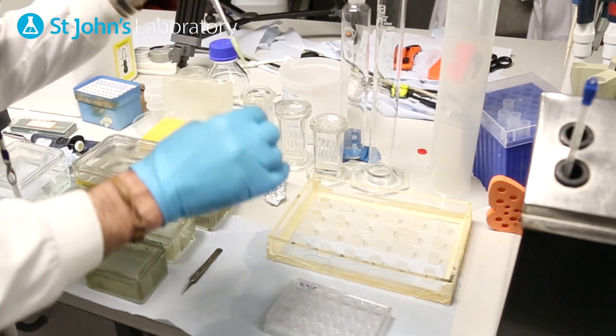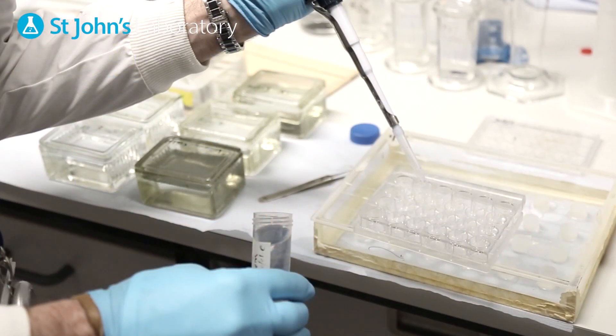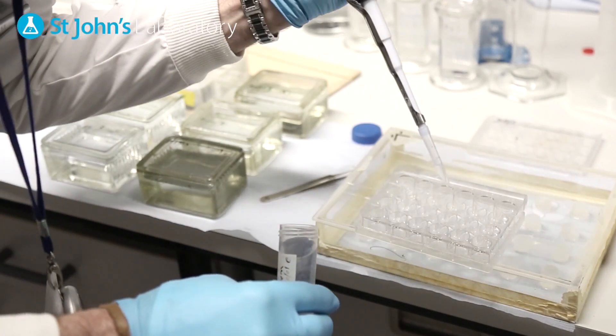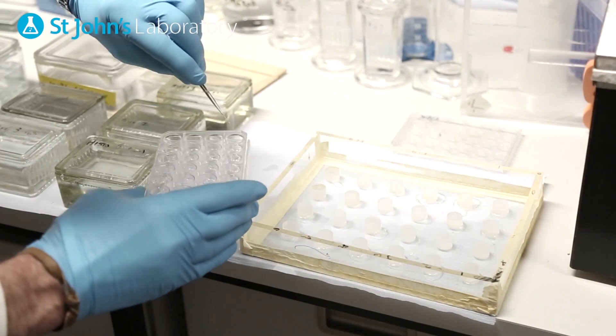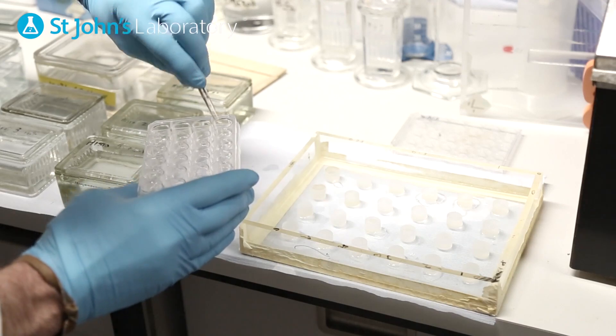Following blocking return the slides to the wells and clean the humidifier unit. Apply the primary antibody and incubate at room temperature for 1 hour. Wash with PBS 3 times to remove any primary remnant.